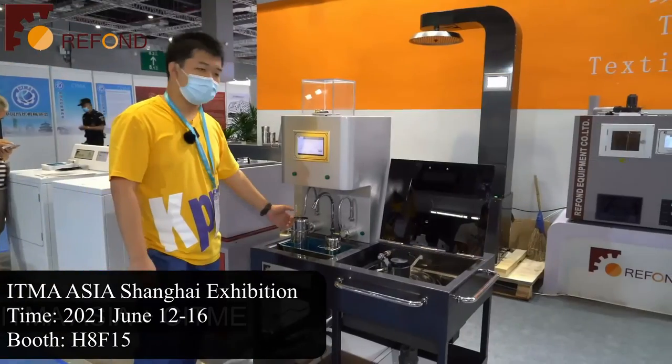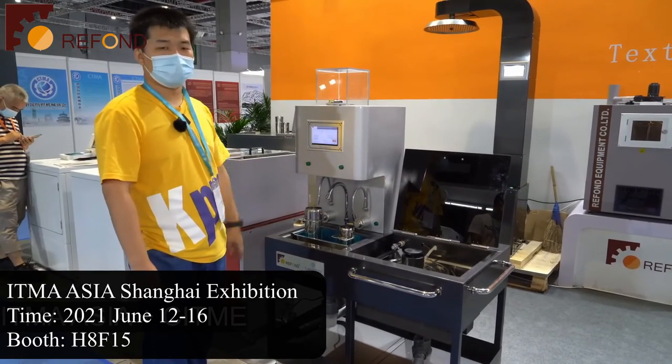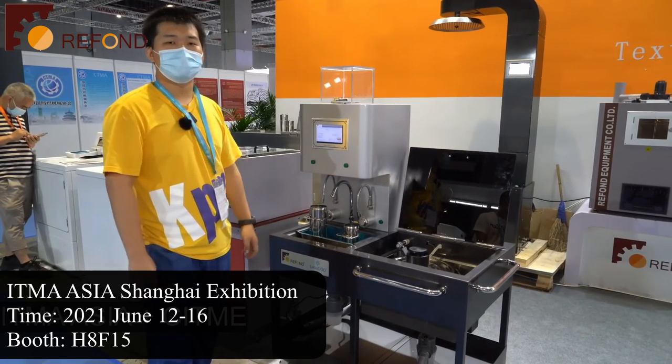This machine is designed to be used with the washing color fastness tester, but you can also use it for many other purposes if you wish.